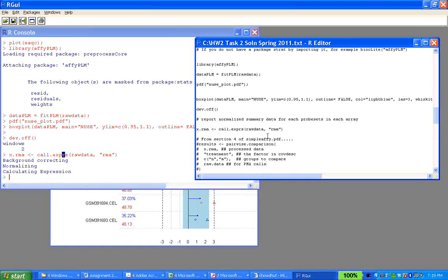So that's called pairwise comparison, because you're doing one gene at a time. In that pairwise comparison, you're going to compute the difference of means. What's the mean value in the lean condition, and what's the mean value in the obese condition? Then what's the test statistic based on those means? Are the means significantly different? From the test statistic, you can also get a p-value, assuming it's a normal distribution.